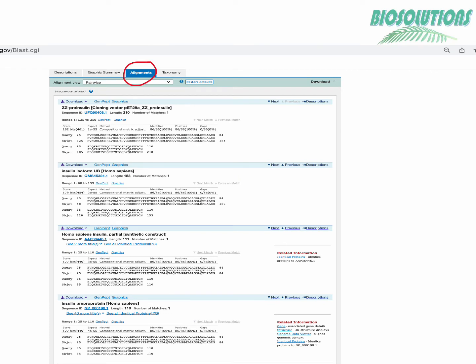Coming to the alignment section it contains the detailed pairwise alignments between query and database sequences. A mini tab at the top contains the alignment statistics. As you can see these are showing us 100% identity and no gaps.